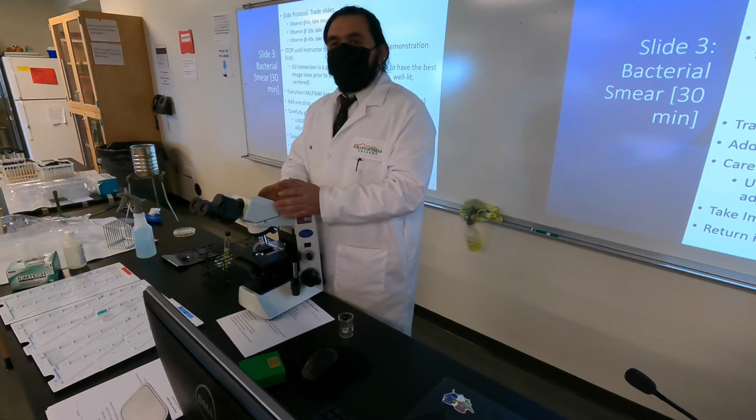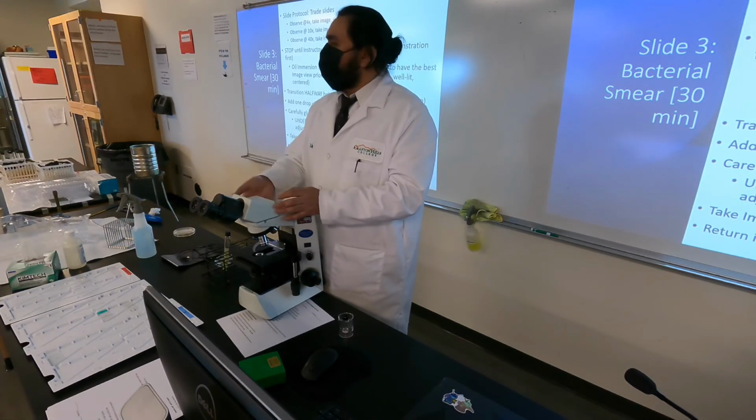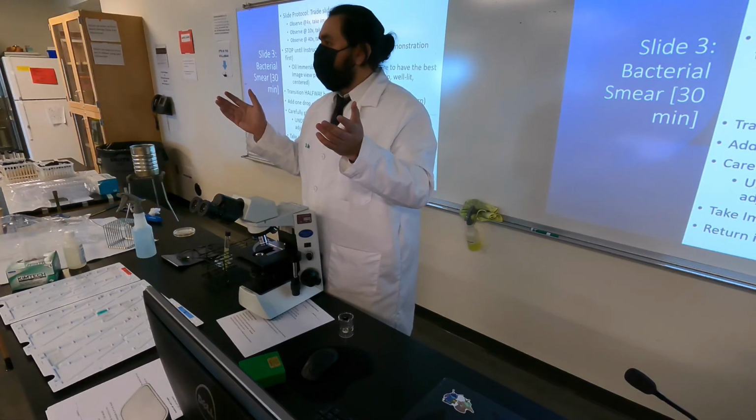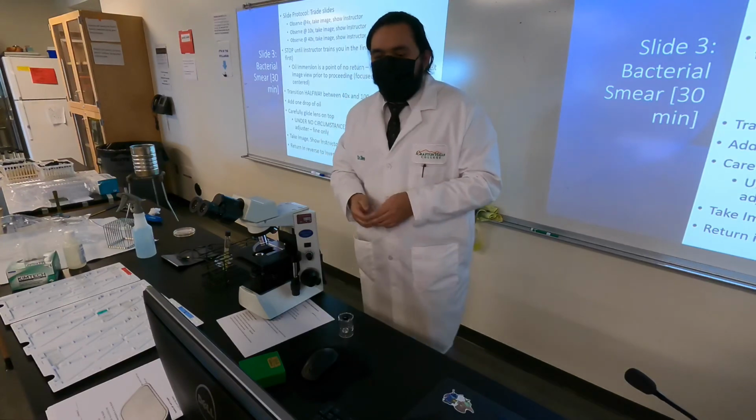Once we're done with that, clean our scopes, clean our lenses, disinfect everything, back up, and we're done. Okay? So that gets that started and finishes off for today.